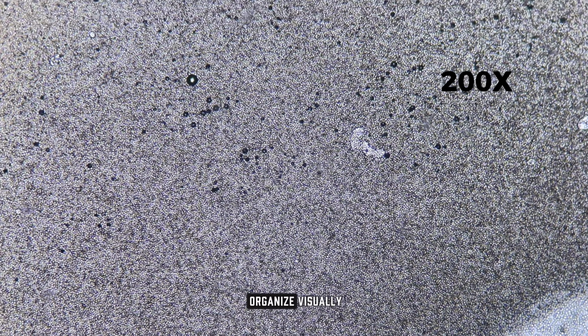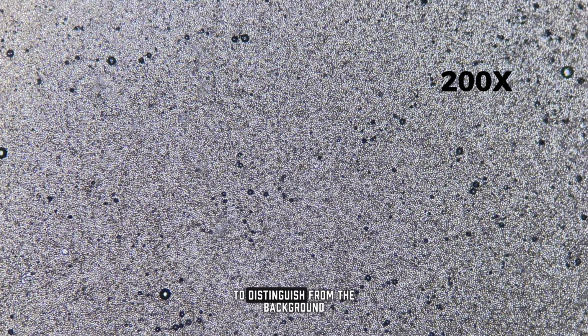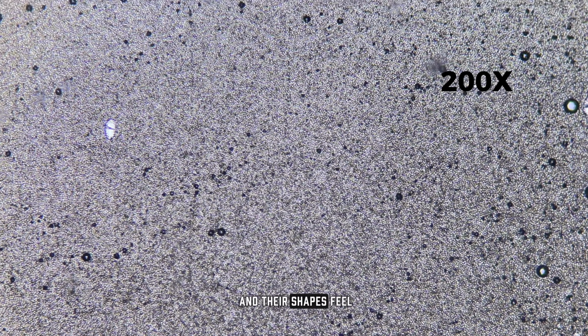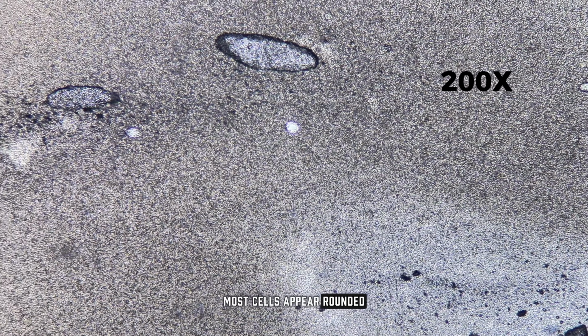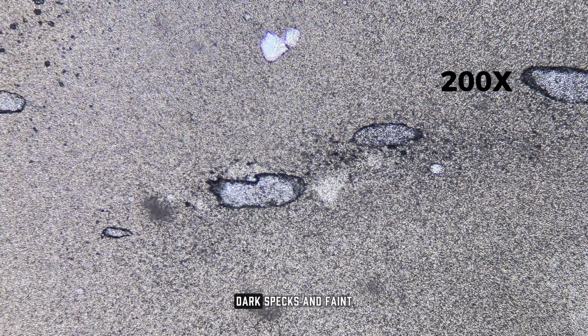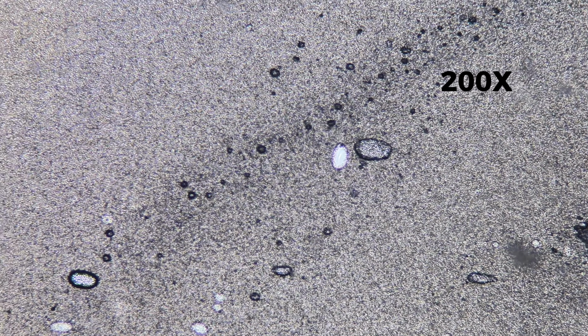At 200 times magnification, the yeast begins to organize visually. Individual cells become easier to distinguish from the background. Their outlines grow sharper, and their shapes feel more intentional. Most cells appear rounded or slightly elongated with soft boundaries. Dark specks and faint internal shadows suggest internal structure.